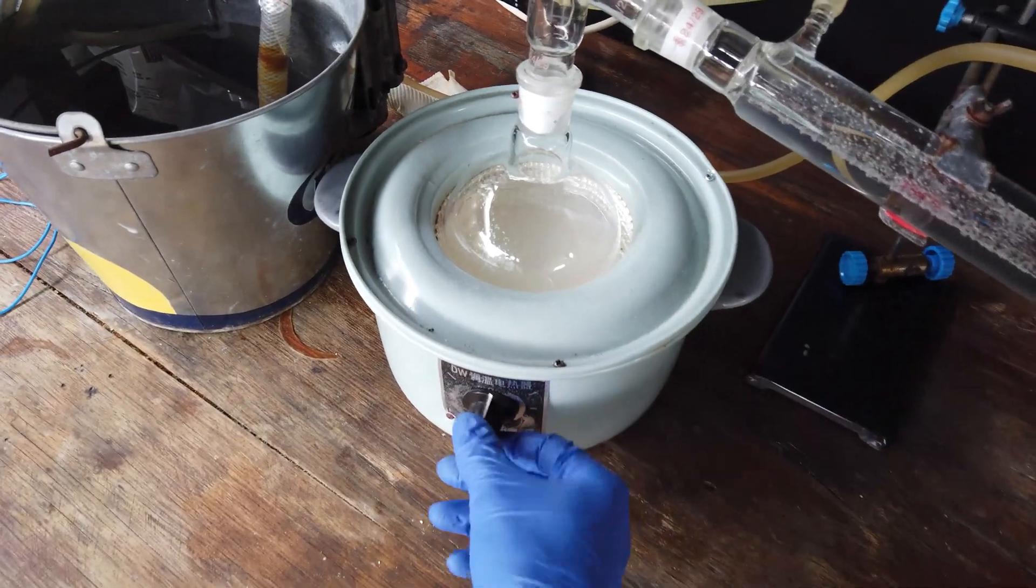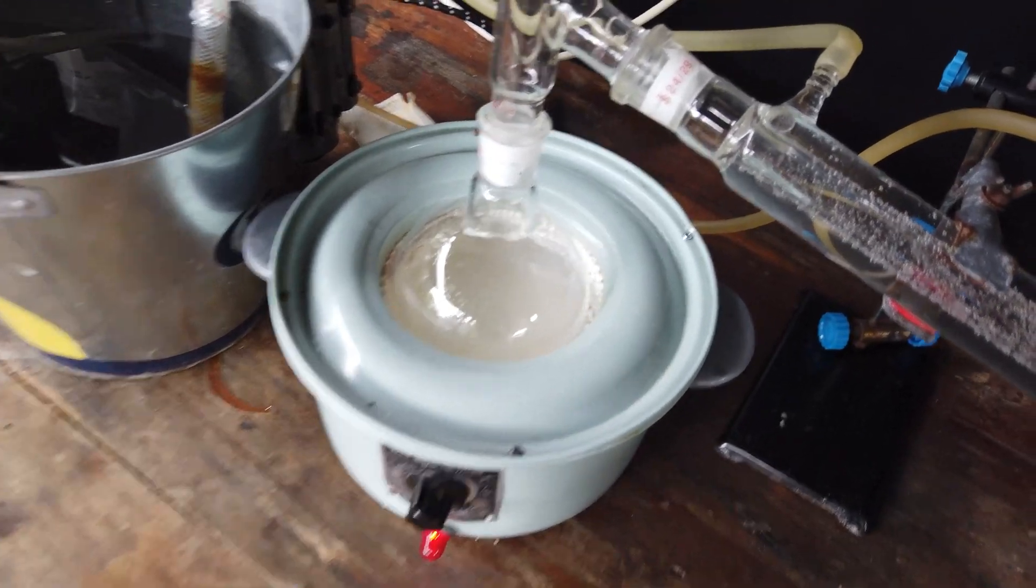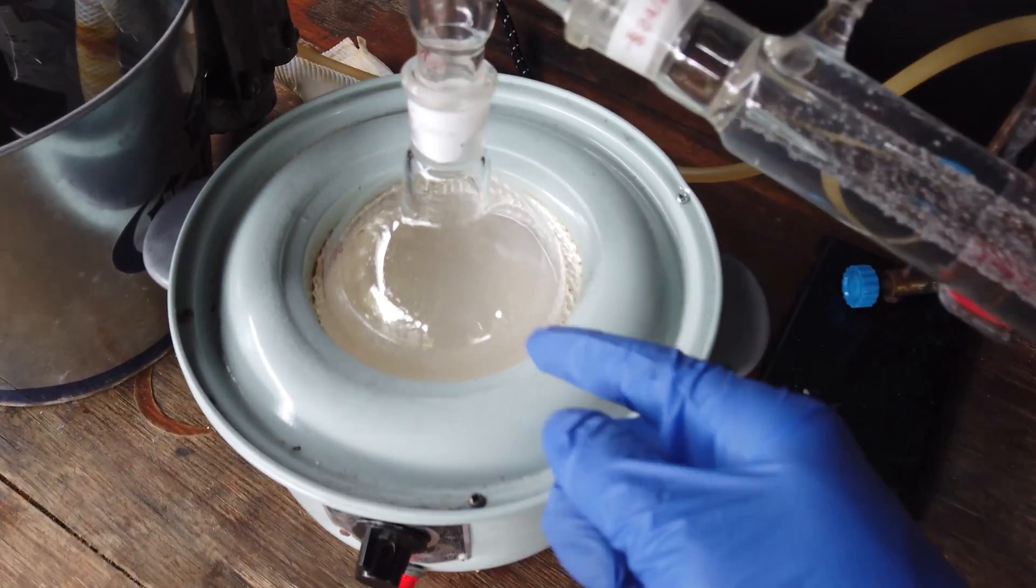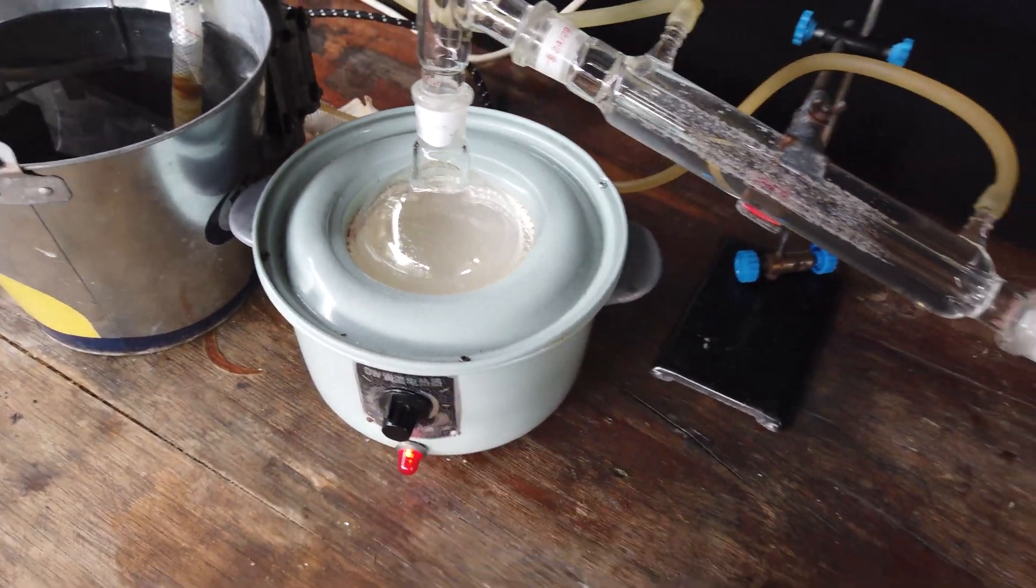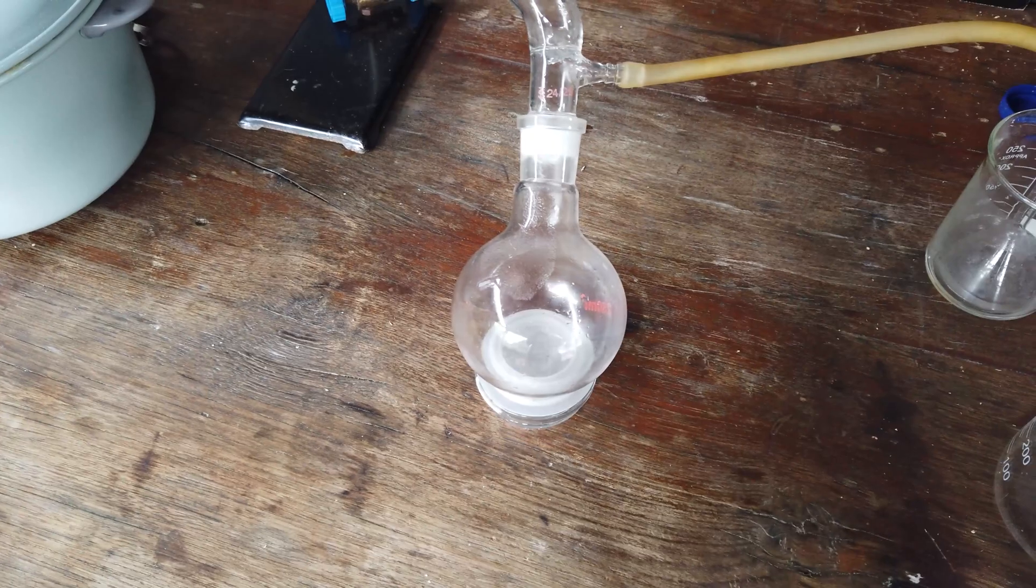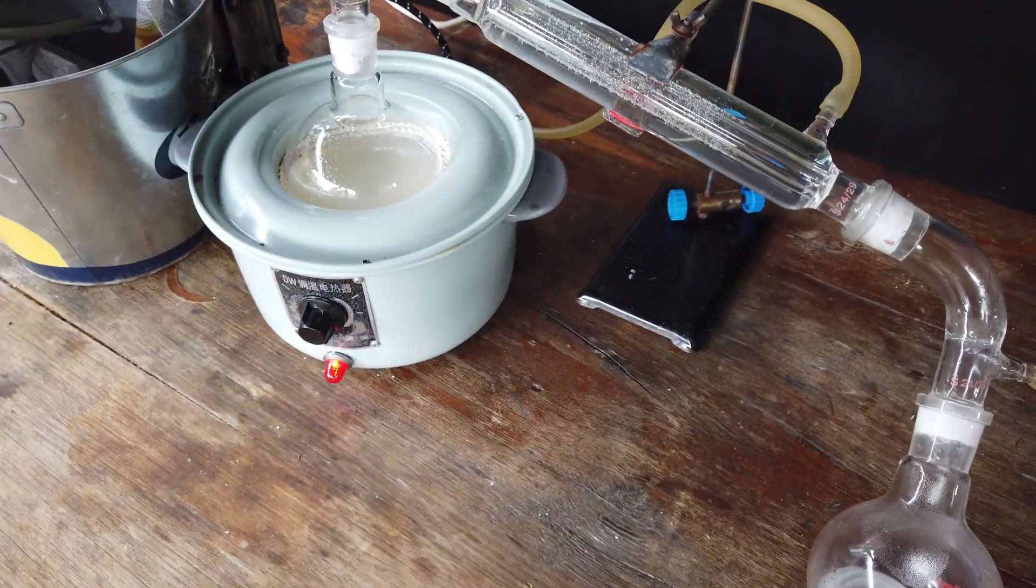Round two, we're ready to go once again. So I'll turn the heating mantle on. You can see our solution is quite cloudy now that we have concentrated the impurities from the previous batch, but once we've finished distilling over this 250 milliliters, I've emptied out the receiving flask. Once we've got that, we will have finished.